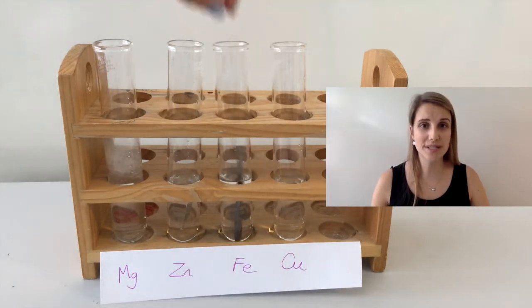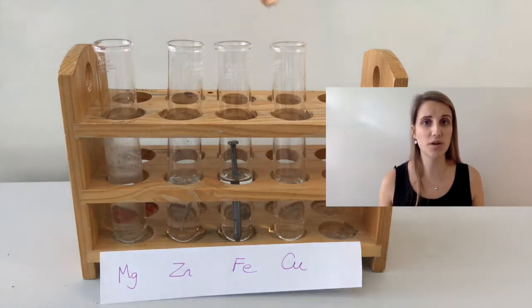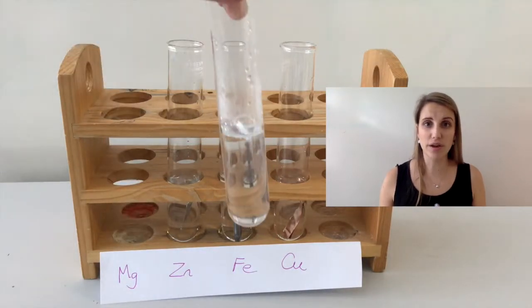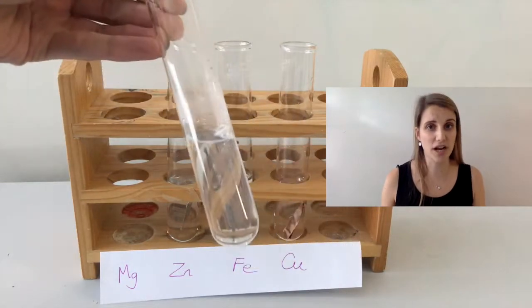For the magnesium, what you can see is that this one is definitely reacting the quickest of all of these reactions. Hopefully you can see it bubbling quite vigorously and really going for it. So this one is definitely the most reactive at the top of our list.